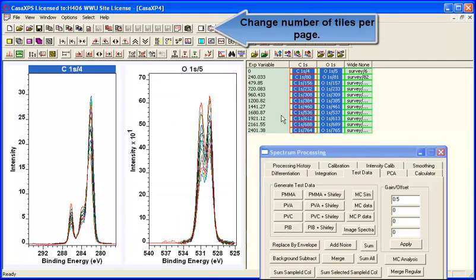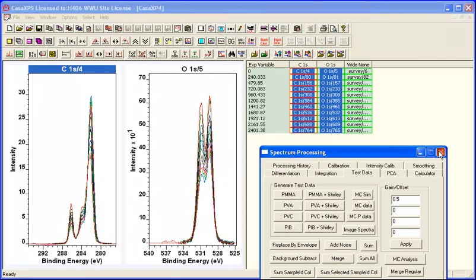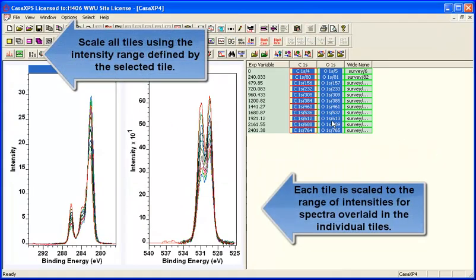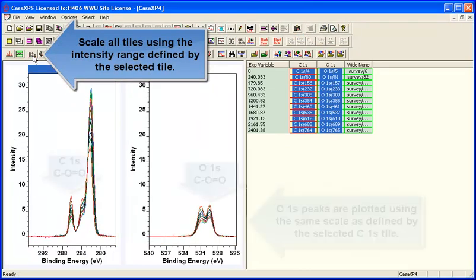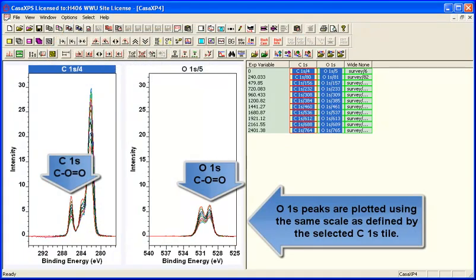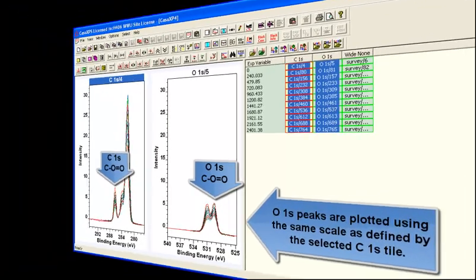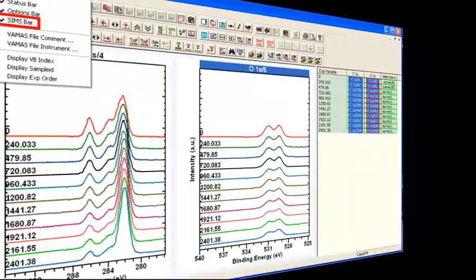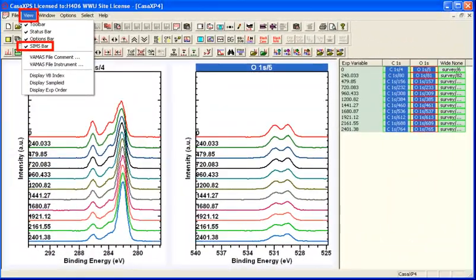So having displayed these two sets of spectra overlaid in distinct tiles, there's an option on the SIMS toolbar that lets you adjust the intensity of the oxygen so that it is displayed in the same proportion as you see in the carbon.